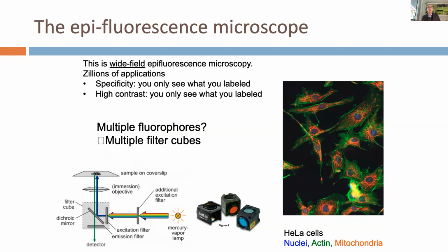Okay, just parenthetically, I showed you an example with one fluorophore, but the optical spectrum is wide, and you can couple many of them. Here, for instance, in a strategy where I have three fluorophores, I could stain separately the DNA content of a cell. In green, you have the actin, that's another part of the cytoskeleton. And in red, you have the mitochondria. This is where the cell produces energy. And so you have excellent images of excellent quality, sparse. And also now you have the context, where the cytoskeleton is related to the DNA and so on.